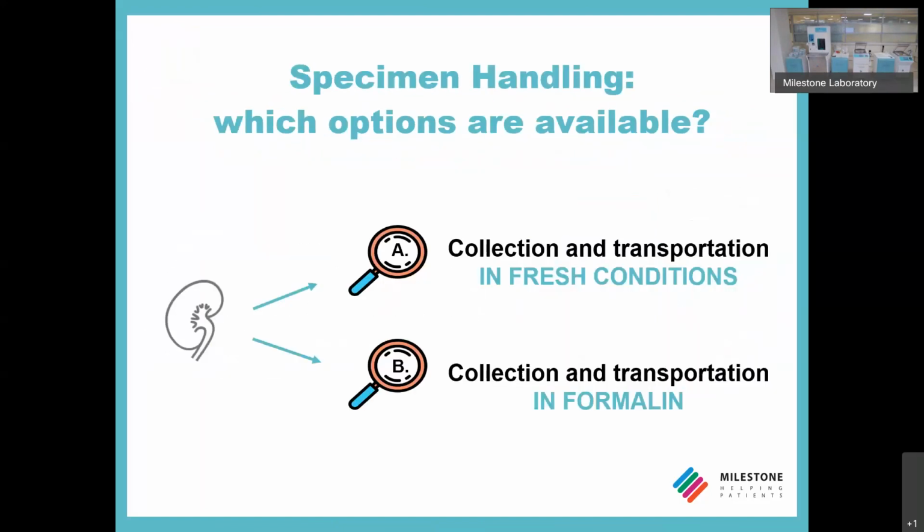With these two considerations in mind, for the specimen handling, which options today are available? Well, definitely we have the option to collect and transport the specimen in fresh condition or collect and transport the specimen in formalin. So formalin, with all the considerations we have made, but still the state-of-the-art fixative.